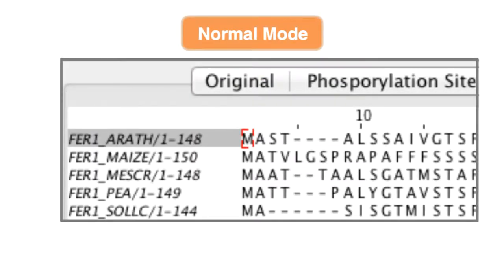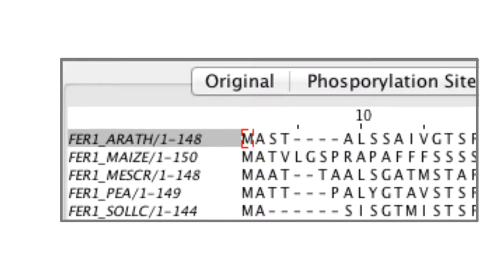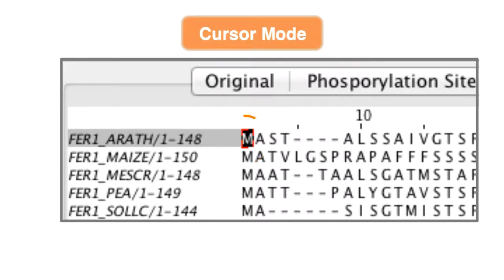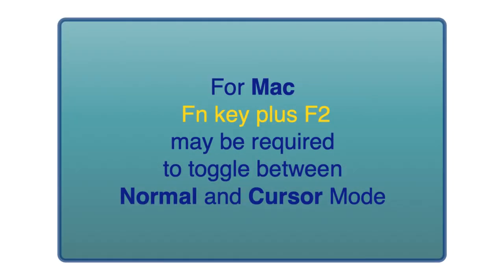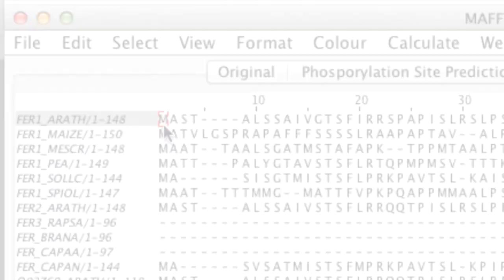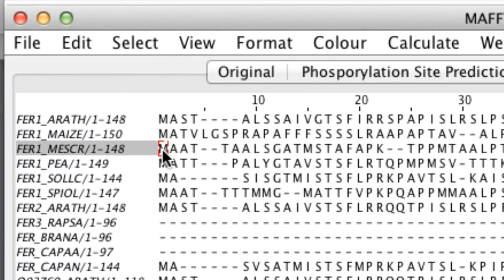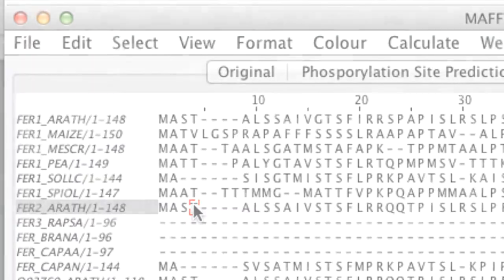When we are in the normal mode this box is clear and when we are in the cursor mode this box is black. Note with a Mac you often need to press the function key and F2 to switch between these two modes as the F2 key is often assigned to screen brightness. Jalview always starts up in the normal mode.